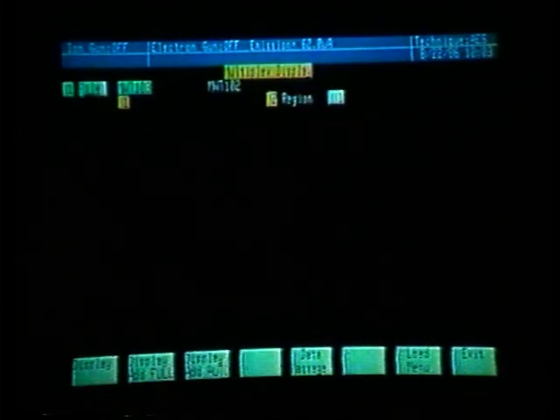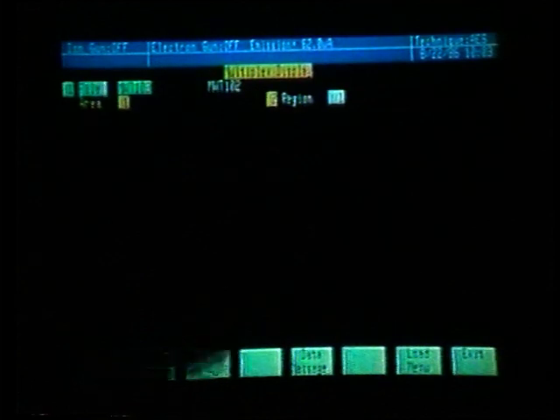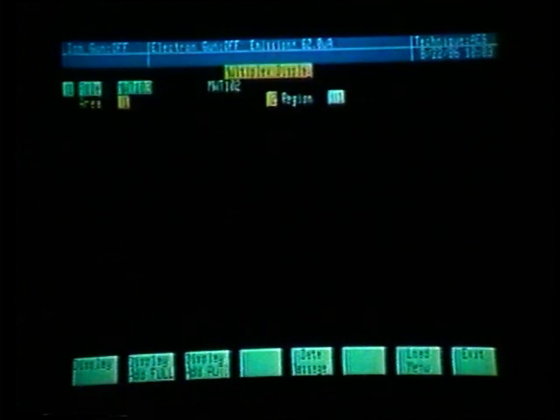At this point, we could actually display and manipulate both of these files. In the load command, as we had seen earlier, we can actually load 3 data files at the same time. When those data files are loaded, the file names appear on line number 1 and can be toggled to whichever file we wish to manipulate.